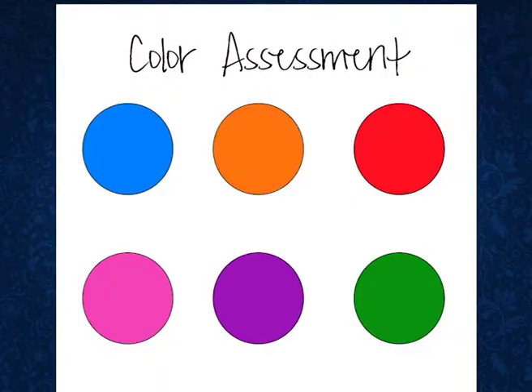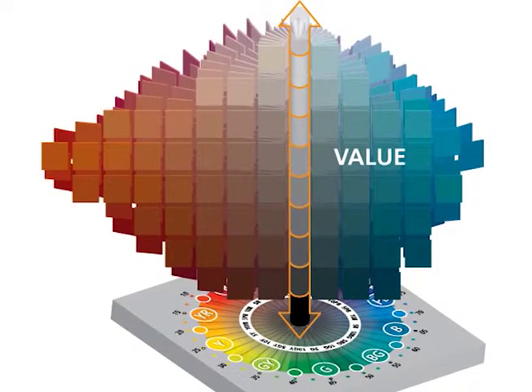The preliminary or initial examination of the paint evidence comprises color assessment, especially the hue, using the human eye and the Munsell color system. The paint evidence comprises different shades of color. The usual color can be determined by the naked eye, but the variety in color shades or its gradient is determined with the help of the Munsell color system.